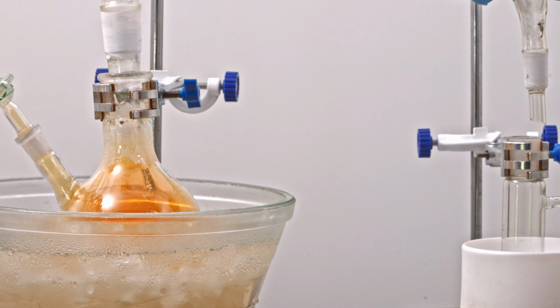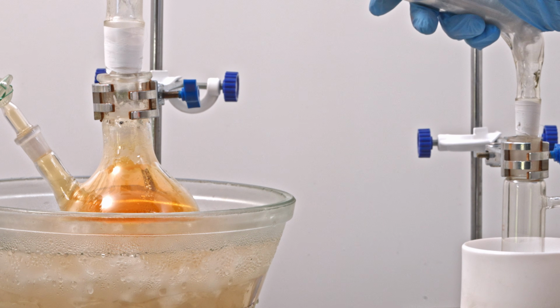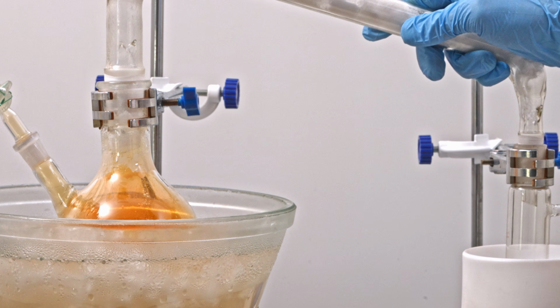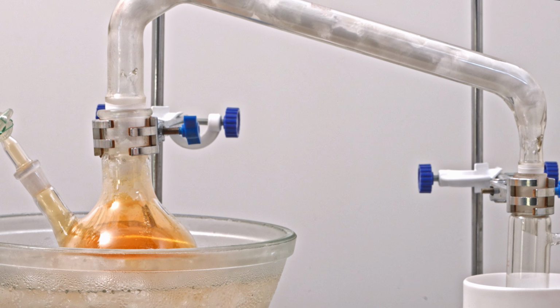After that, I put a bent tube filled with phosphorus pentoxide on the flask. This is actually the most important part of the setup for synthesizing dinitrogen pentoxide.